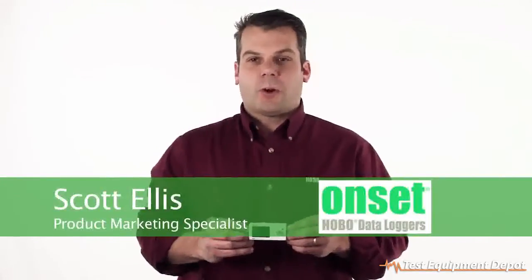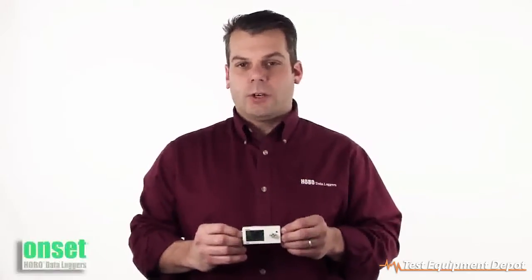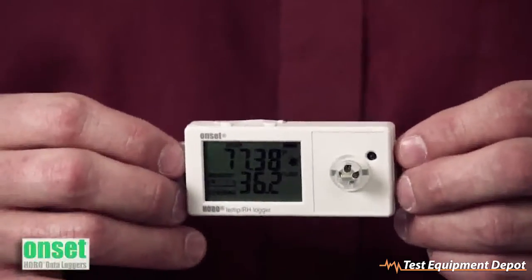Hi there, I'm Scott Ellis with the Product Marketing Group here at ONSET, and today we're going to take a look at ONSET's next generation UX100 Temperature and Relative Humidity Logger. This particular unit is the UX100-011.